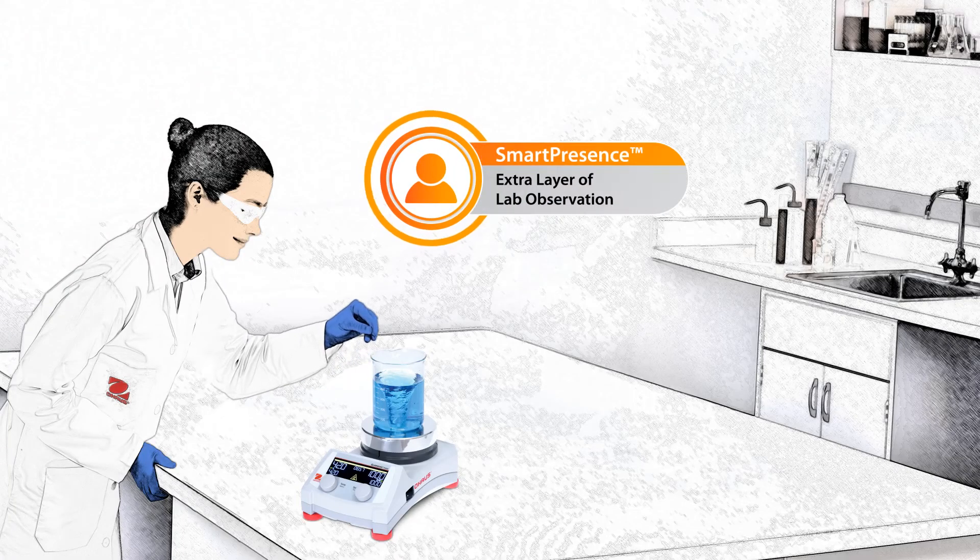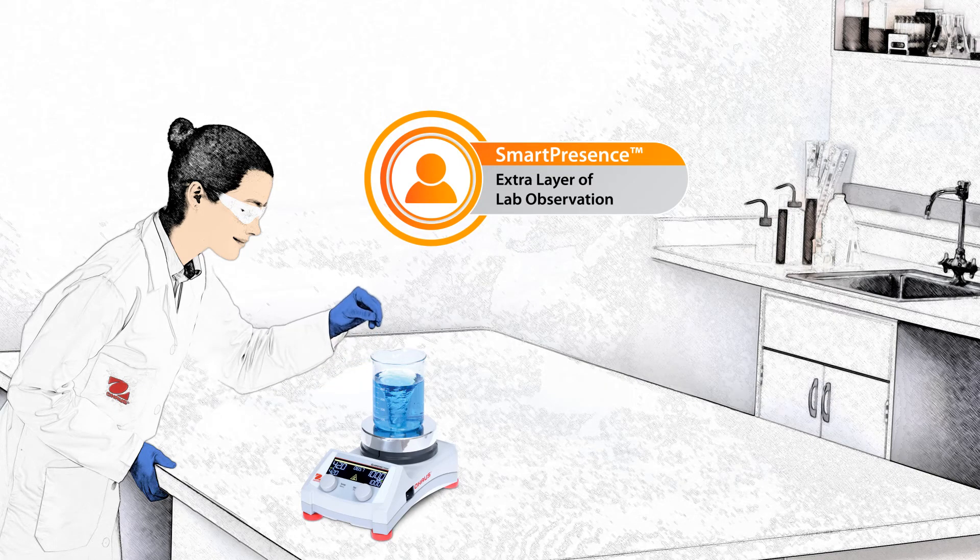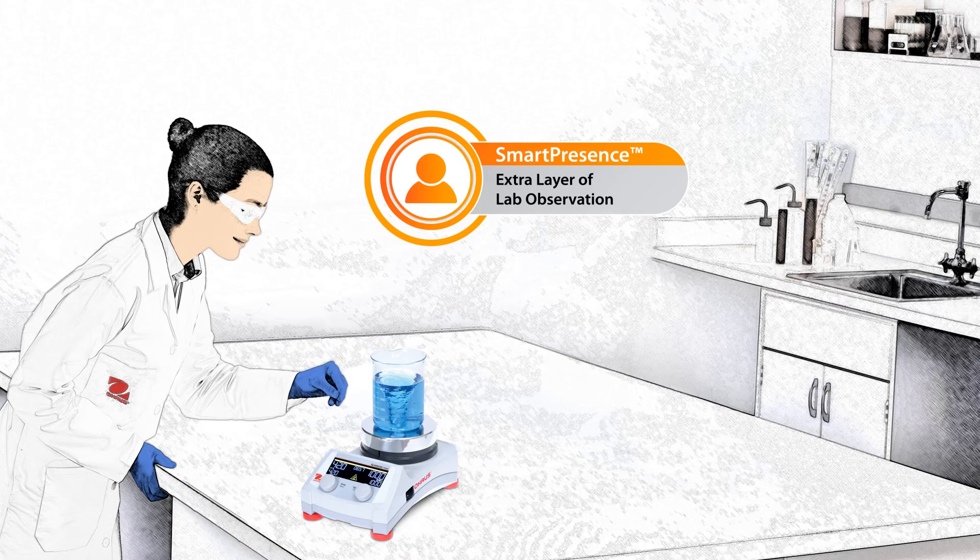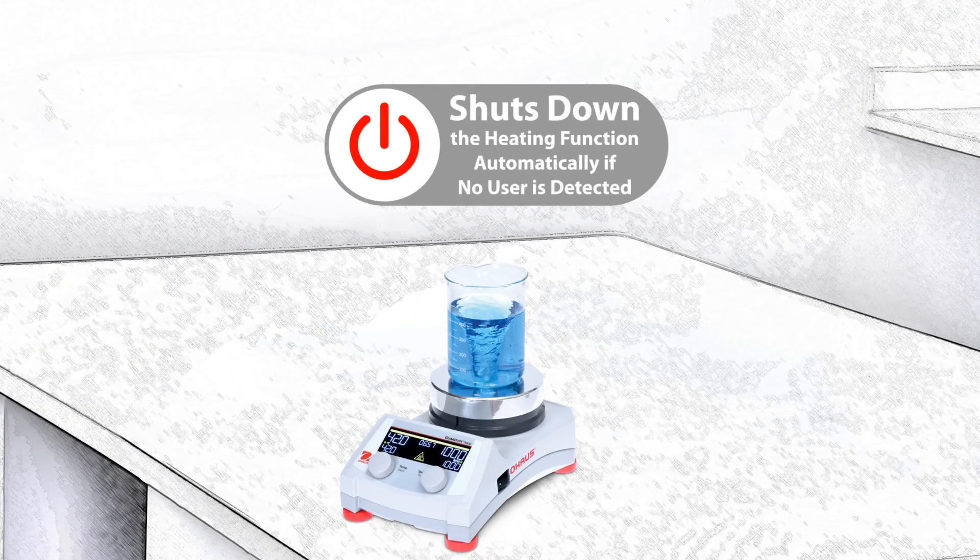Smart Presence adds an extra layer of lab observation to keep both lab operators, sensitive samples, and your laboratory safe from accidents, even when you accidentally leave your Guardian 7000 hot plate stirrer unattended.